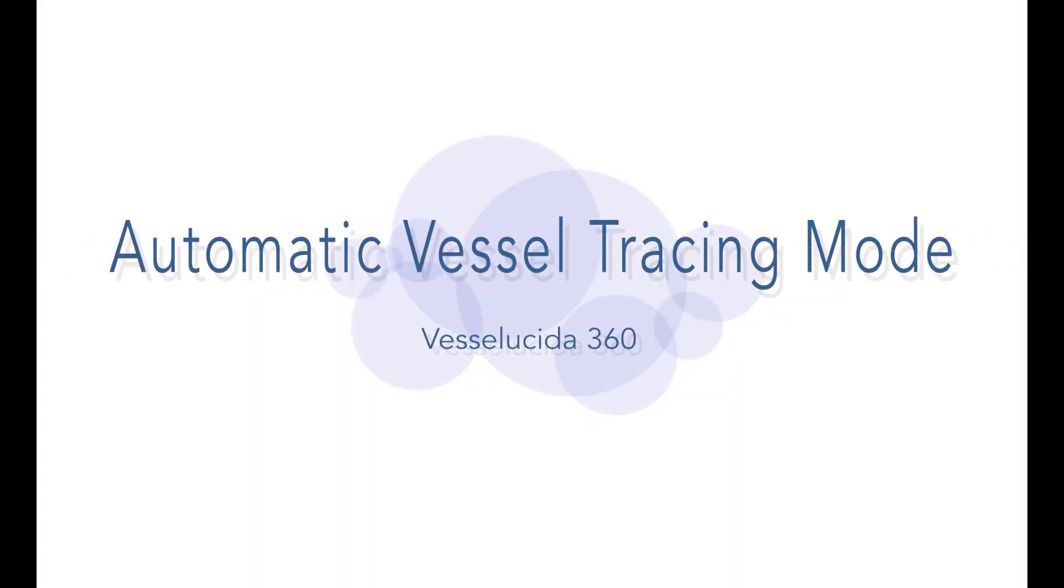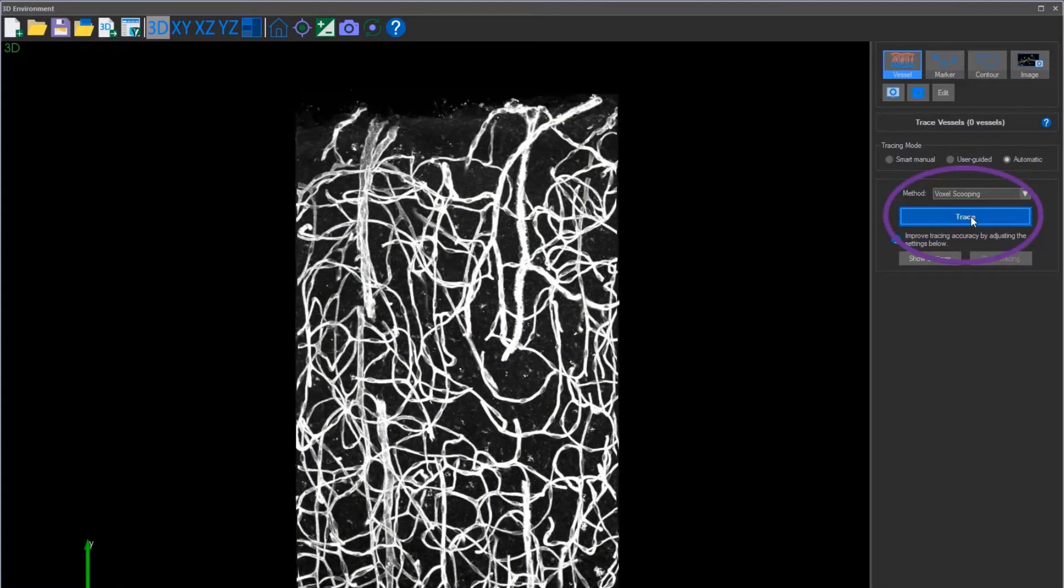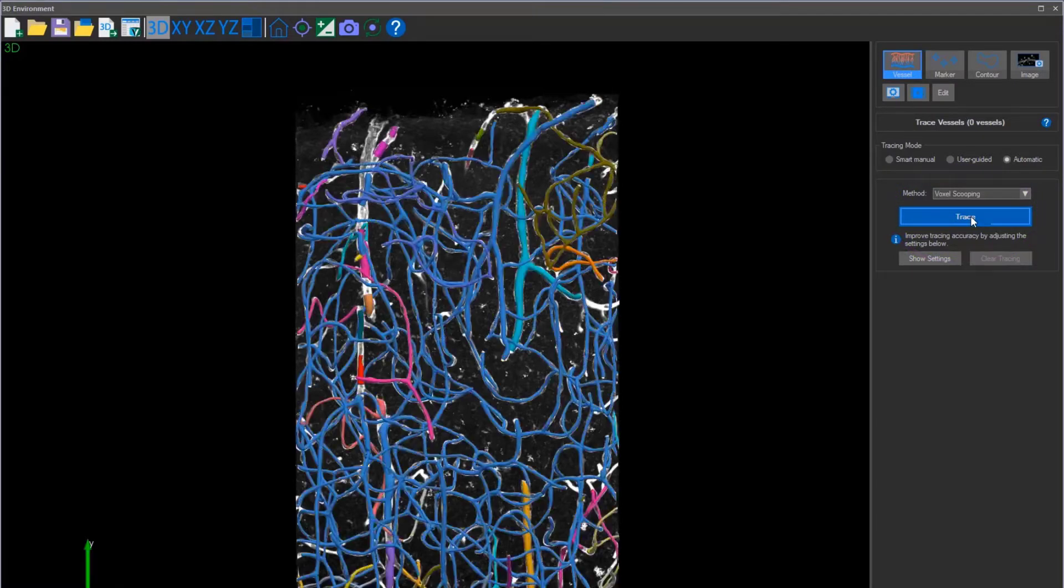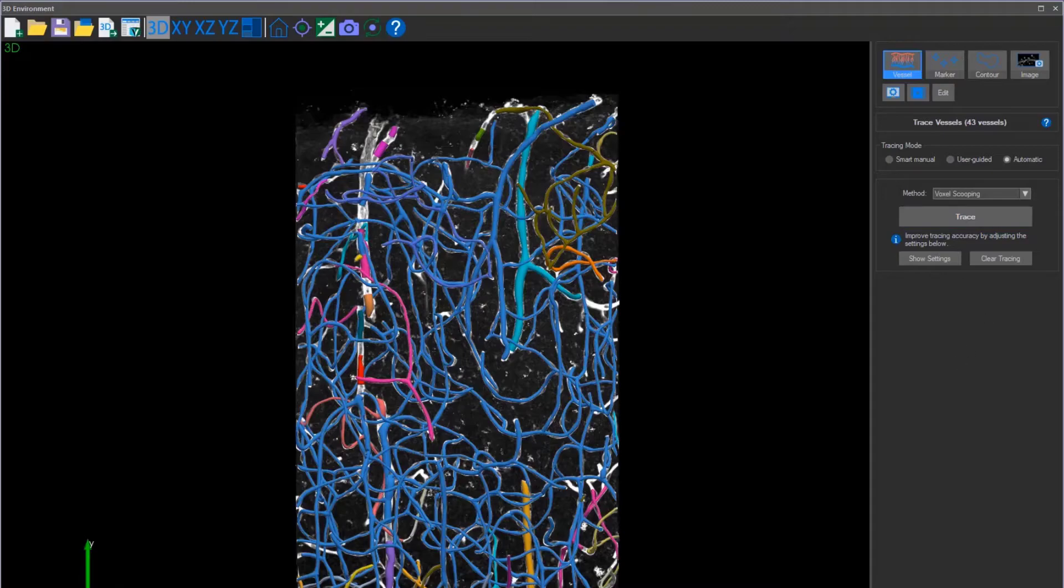Microvascular images can be extremely complex and intricate. Use Veselucida 360's automatic mode to trace images of any complexity automatically in a matter of seconds. Vessel segments that weren't connected to one another will show up in a different color, but with Veselucida 360's editing functions, they can be connected and accurately reconstructed quickly.